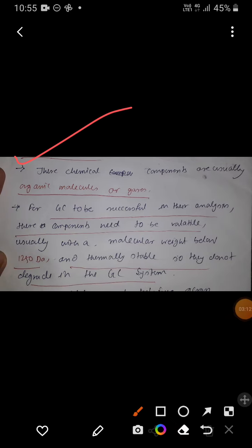So here we are separating mainly organic molecules and gases for GC, and now the important thing we need to keep in mind is that the components we are going to separate with the help of gas chromatography should have two important characteristics. One is the compound should be volatile with a molecular weight below 1250 Dalton. Okay, and the second important thing is the compound should be thermostable. Why? Because remember, inside the gas chromatography there is generation of high heat, so we need to use thermostable components for separation, otherwise there will be a chance that our component will be degraded and that will be a wastage. So these two things we have to keep in mind.